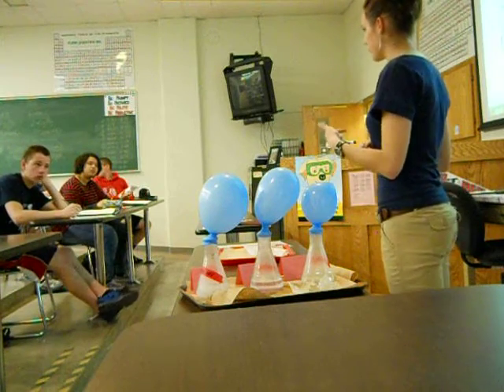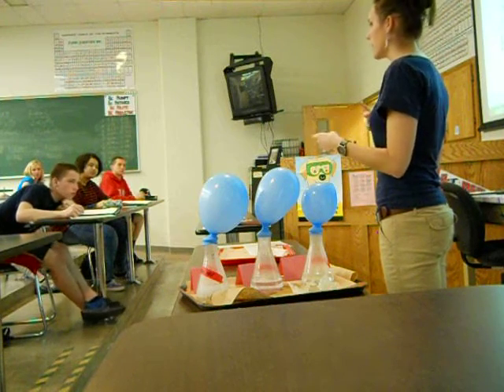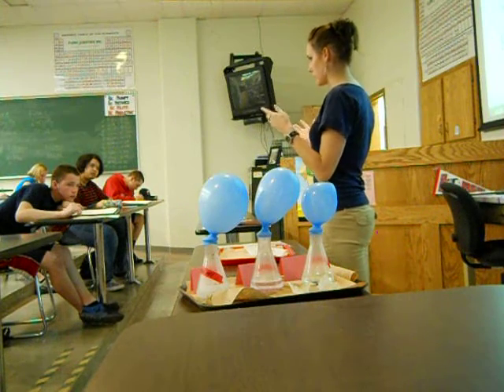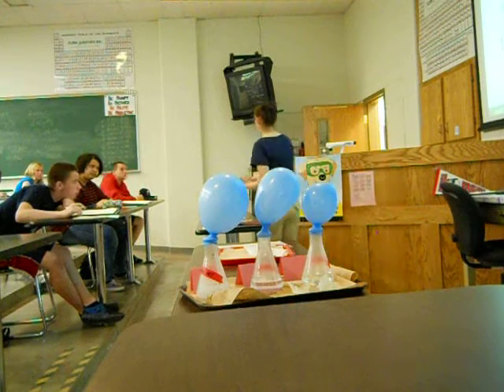Now flask B. Is that our control? Isn't it kind of like our control? Yes, flask B is kind of like our control, as Lily pointed out. And in flask B, we had both of our reactants completely used up. So I'm just going to write that we had a 1-to-1 ratio to let myself know that both of our reactants were completely used. And you can make note of that too. You can say that both reactants were completely used up. Whatever will help you remember what that 1-to-1 ratio stands for.